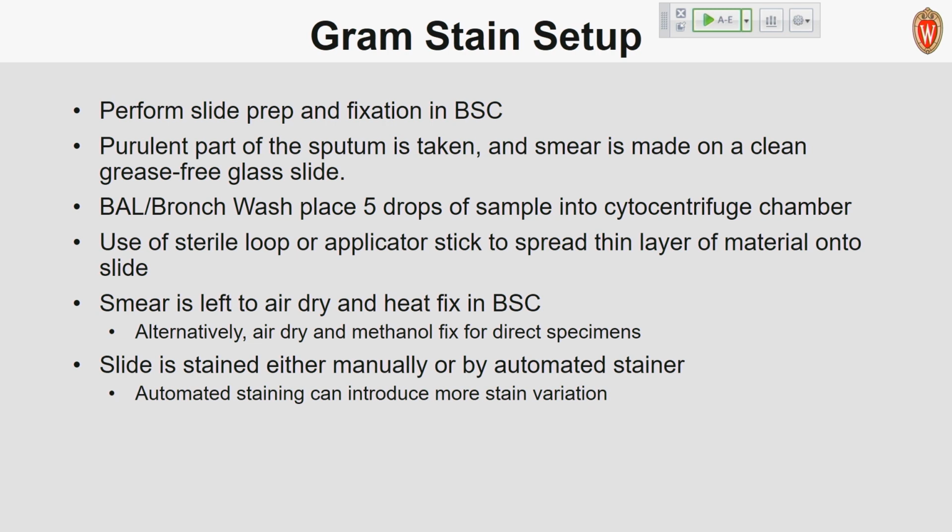And then you proceed with staining the slide either manually or with an automated stainer. Automated staining can introduce more stain variation, so I would be curious to see those. Is everybody here using an automated stainer? Is there still a pretty good mix of manual stains occurring on these specimens? I think of a sputum specimen. Let's see if I have that on the next slide here.